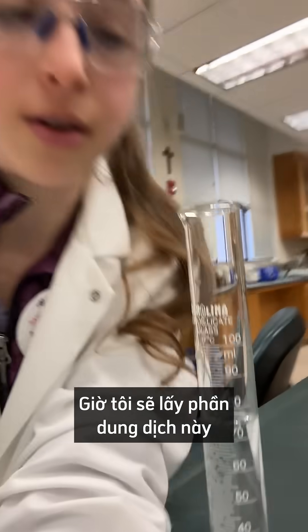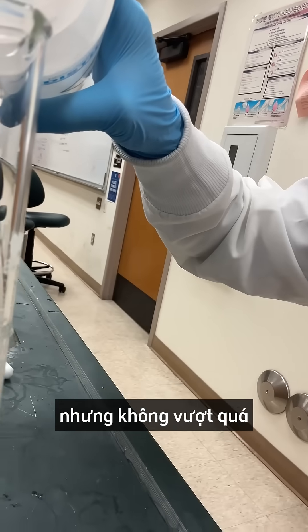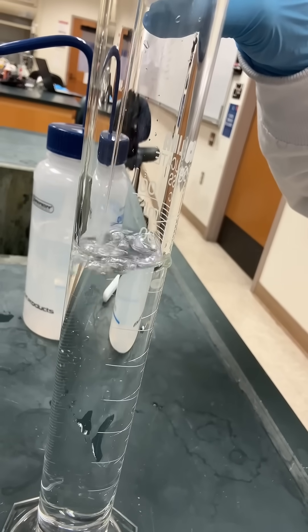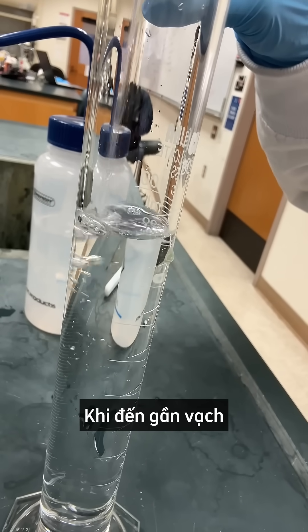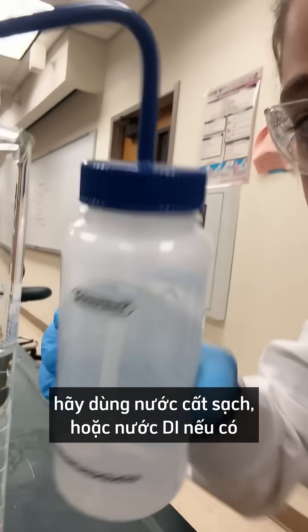Now what I do is take my liquid and fill it until I'm getting near the meniscus mark, but not overshooting it. When I get close, take your DI water.